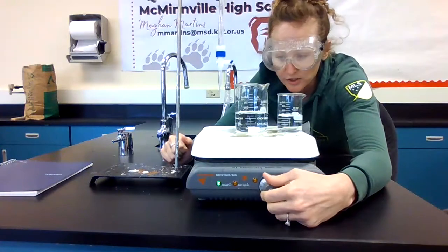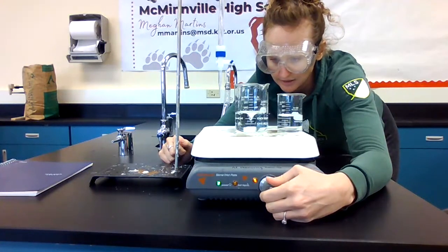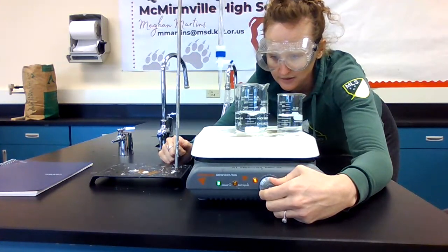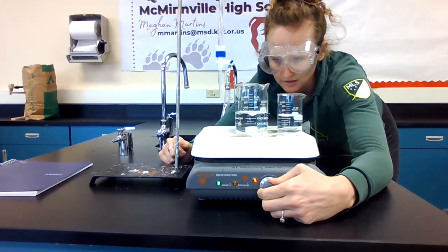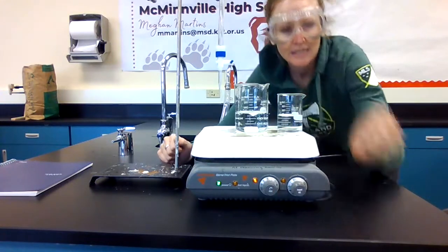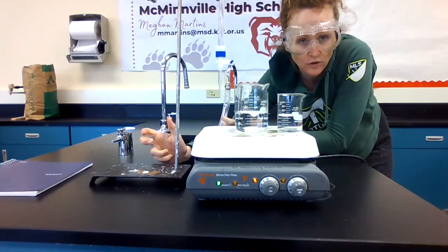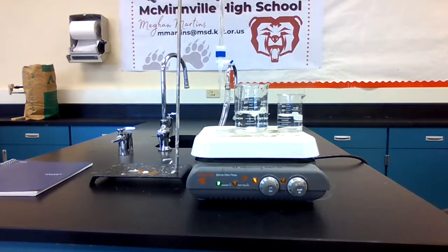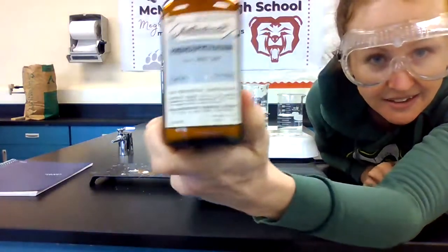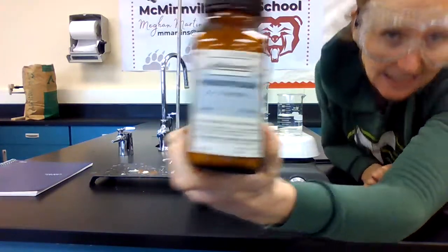Now I'm going to start stirring this, and you can see as my little stir bar gets going, it forms a nice little vortex. There we go. In order to have a color change happen as this reaction proceeds forward, we need another molecule in here. Meet phenolphthalein. Phenolphthalein is what we call an indicator.